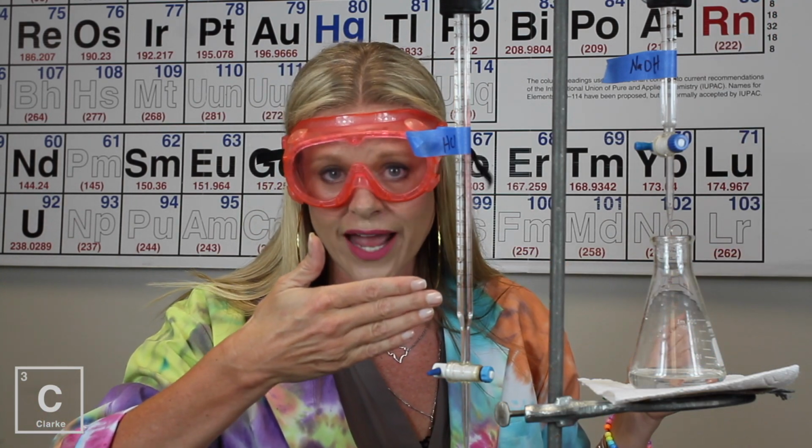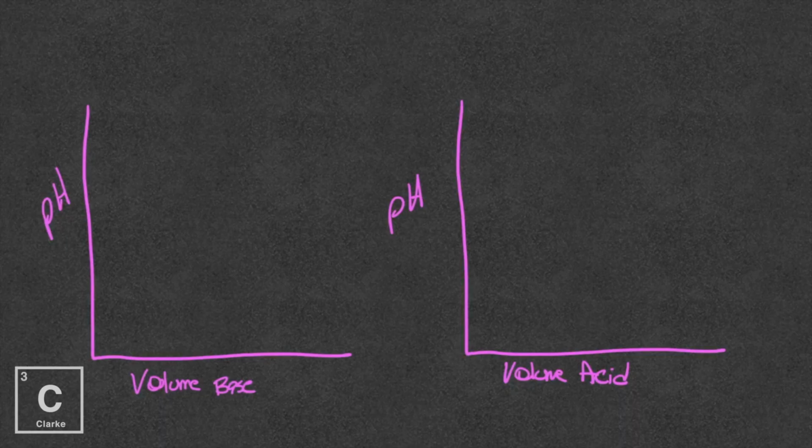In this burette here, I have sodium hydroxide. I don't know the molarity of the sodium hydroxide. Here, I've got hydrochloric acid, just in case I need to add a little bit more. Let me show you a titration curve right quick. So let's look at these curves. And again, these curves are true for strong acids and strong bases.